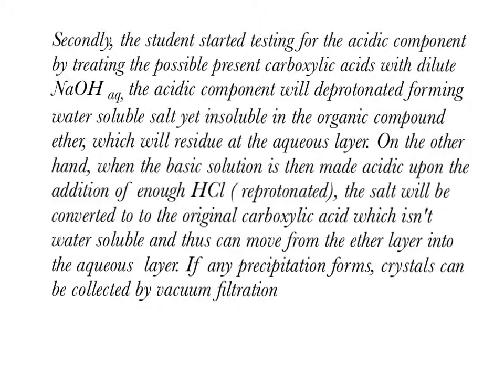Secondly, the student tested for the acidic component by treating the possibly present carboxylic acids with dilute sodium hydroxide. The acidic component will be deprotonated, forming a water-soluble salt that is insoluble in the organic solvent ether, so it remains in the aqueous layer.